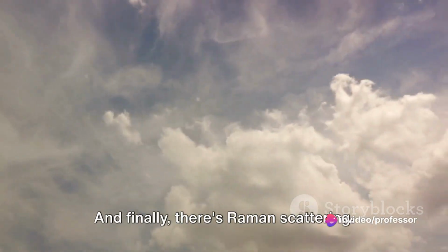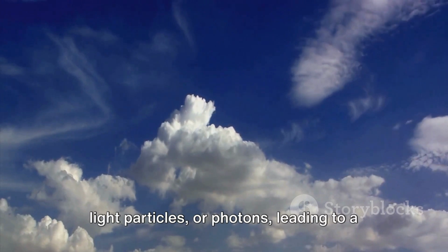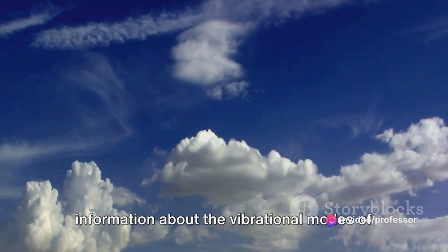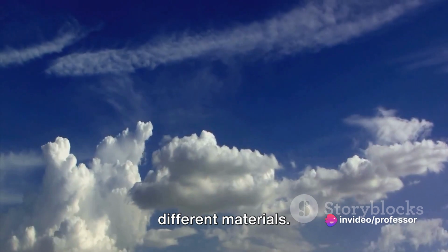And finally, there's Raman scattering. This is a little different. It involves a change in energy of the light particles, or photons, leading to a change in their wavelength. This can provide us with detailed information about the vibrational modes of molecules, helping us to identify different materials.